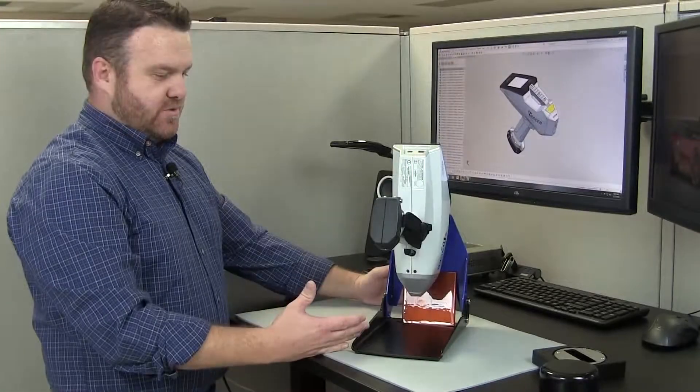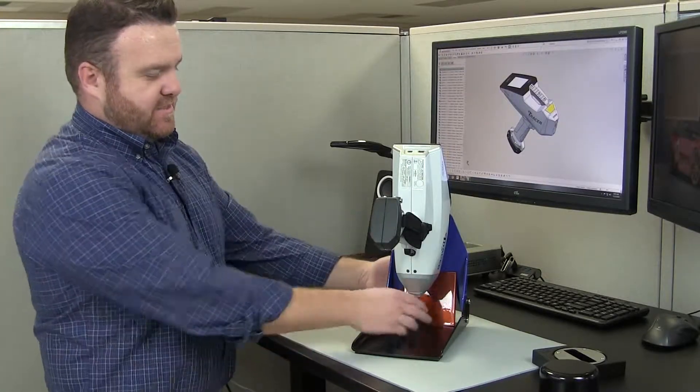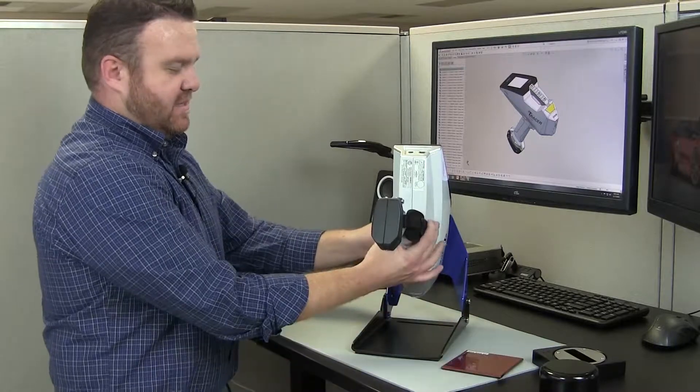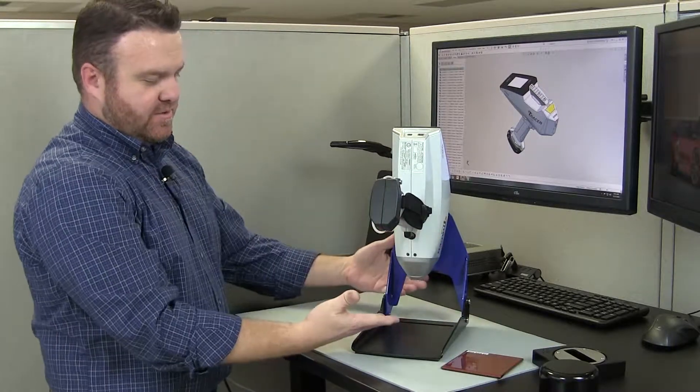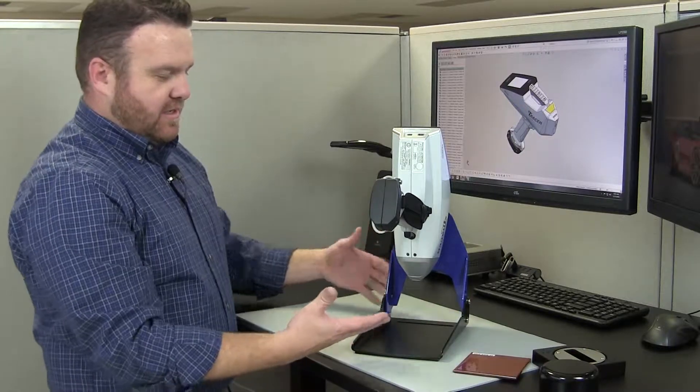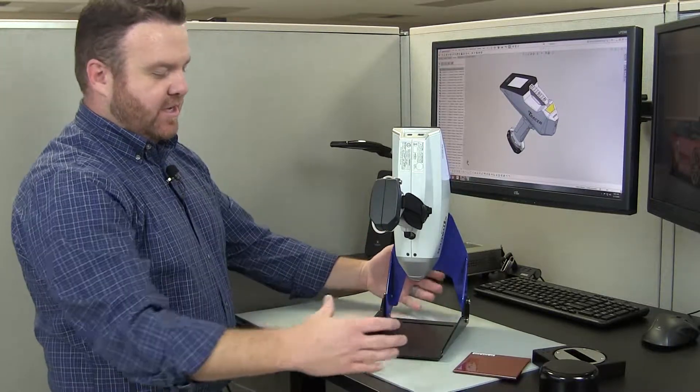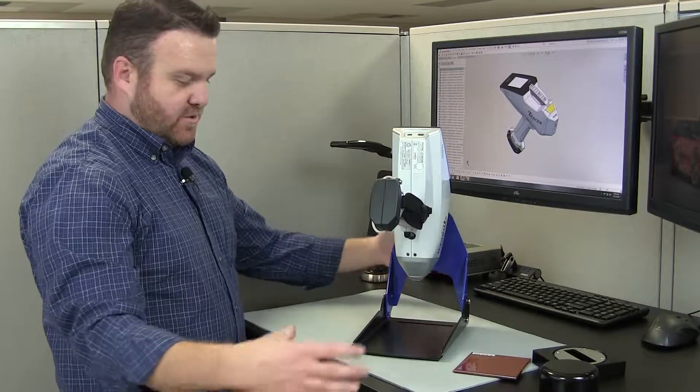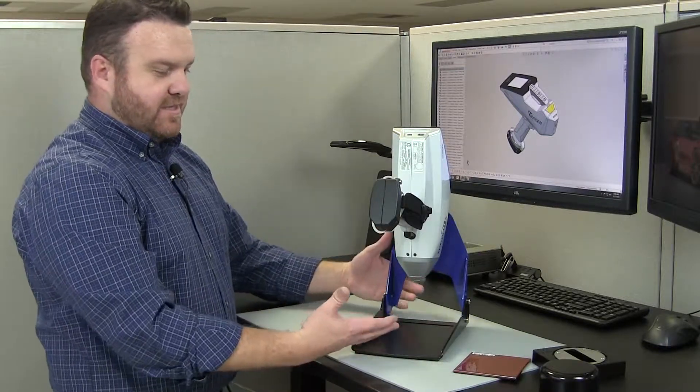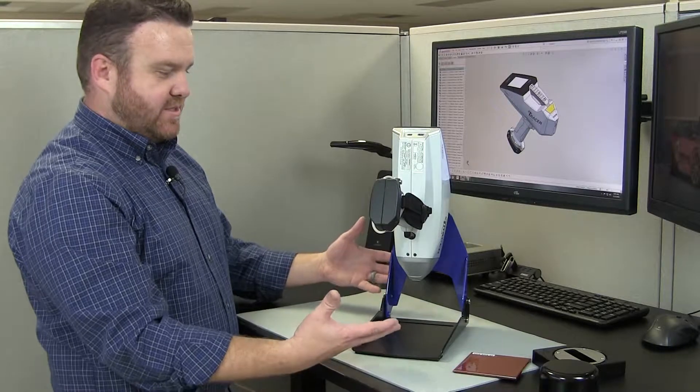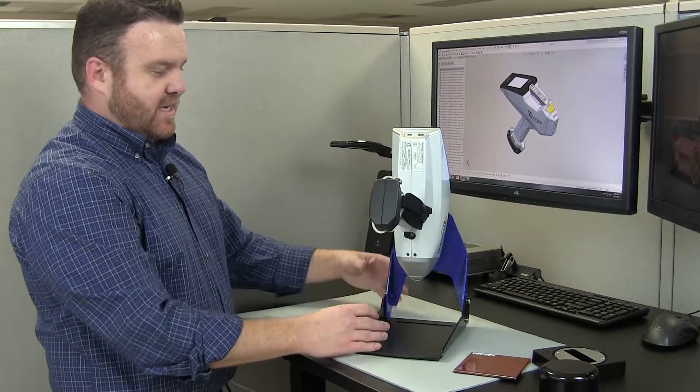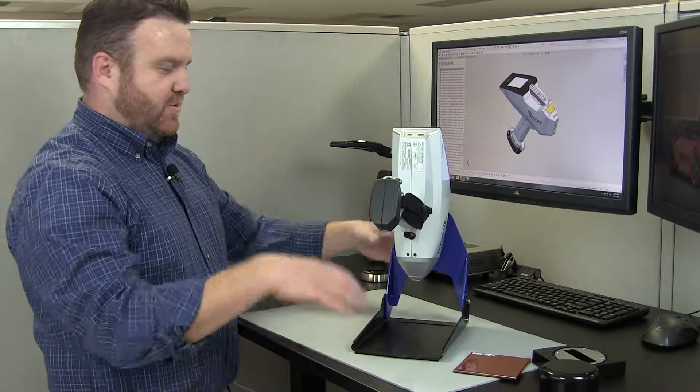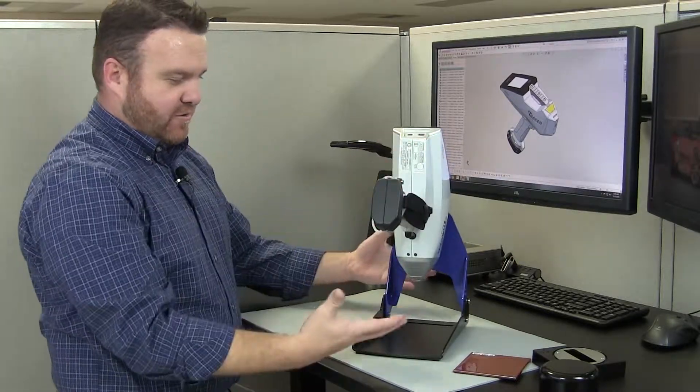For the user, the ease of accessibility to be able to have this height adjustment I think is very critical. Understanding that there are limitations to the stand - you could potentially put larger samples on top of this, but it is a desktop stand meant to be used in a desktop application, not for something very big and industrial.